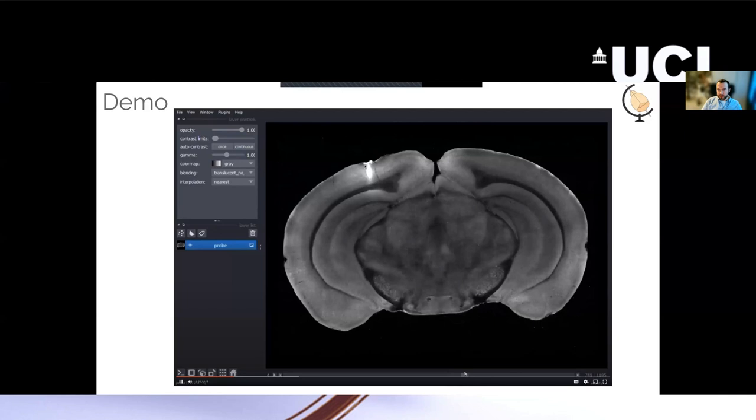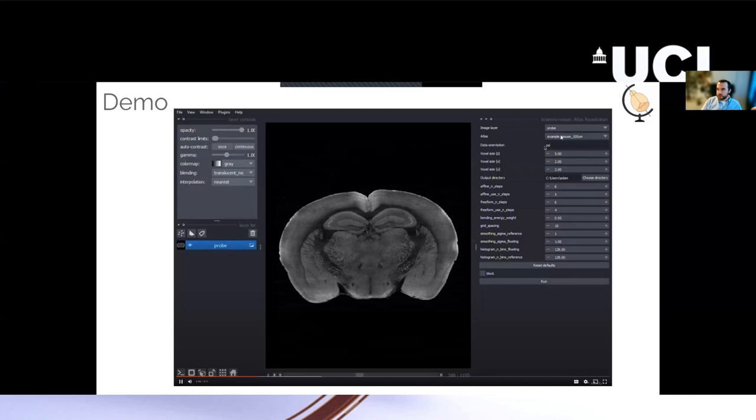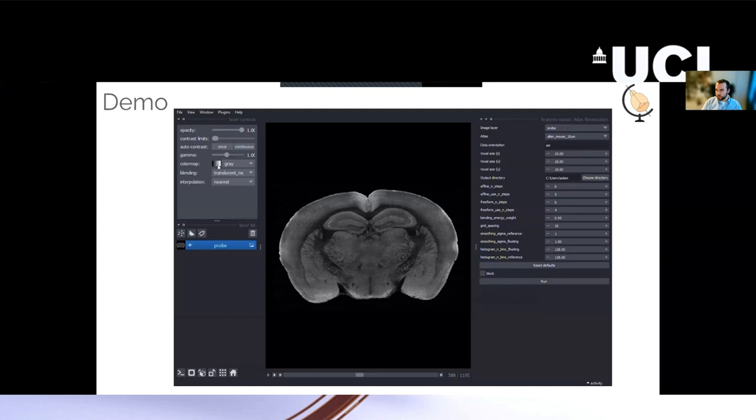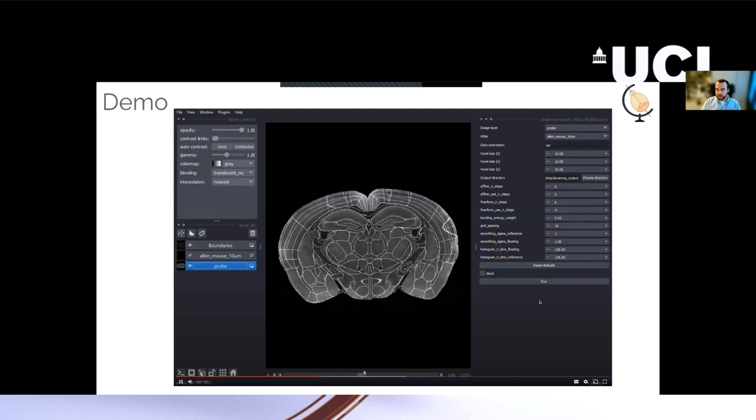So the first step is to open up the BrainReg plugin. You can't see it, but you just go to plugins and then BrainReg. There's a few boxes to fill in. You choose the image you want to register, the atlas you want to use, give it some metadata, things like the orientation and the voxel sizes. Choose where you want to save your data, somewhere on disk, and then you just press run. There are some various parameters here that you might need to change eventually, but usually you don't need to tweak these too much. This does take a while, usually a few minutes depending on the atlas and the resolution of your data. In this demo, it's magically happened instantly.